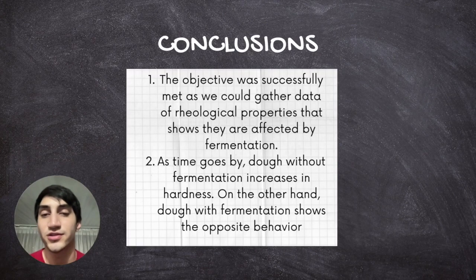As for the conclusions, first, the objective was successfully met as we could gather data of the rheological properties that show that these are affected by the fermentation process. Second, as time goes by, the dough we have without the fermentation increases in hardness. On the other hand, dough with the fermentation shows the opposite behavior.